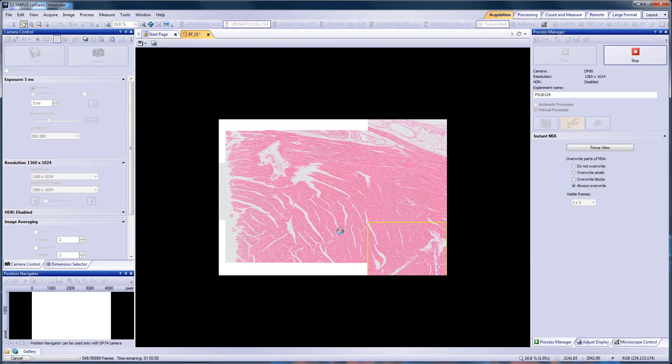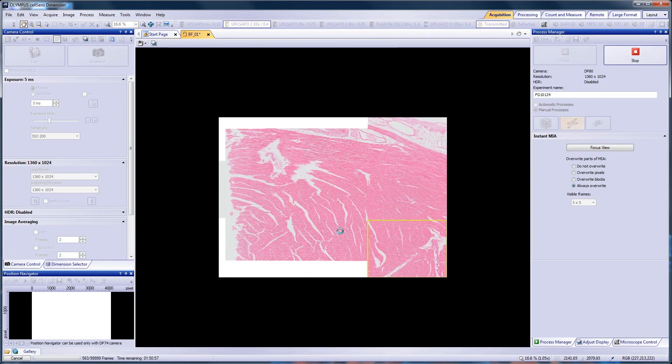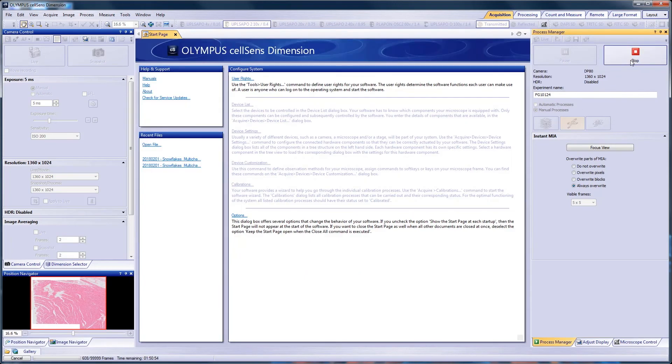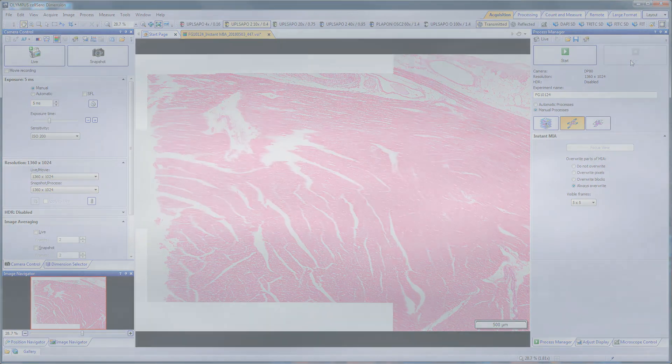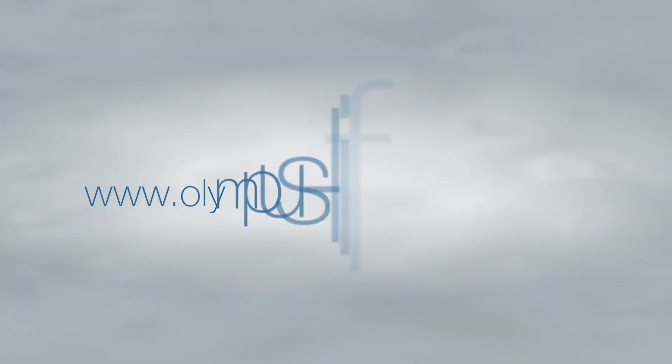When you are happy with your image, click Stop. Images will be saved depending on your acquisition settings for the Process Manager.